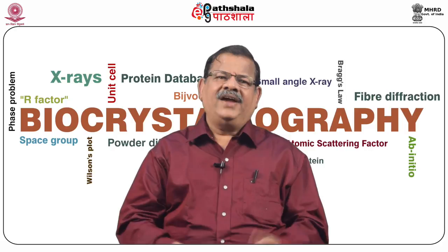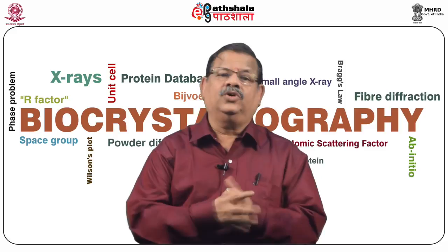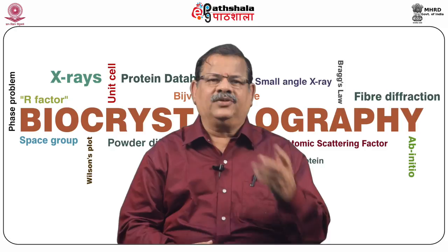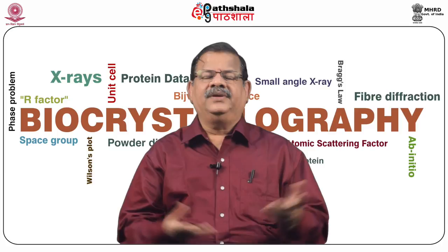Now, finally, we have to determine the hydrogen atoms. So far, we determined only the non-hydrogen atoms. Now, hydrogens are also there, maybe 20 or 25 hydrogens. They also substantially contribute to the intensities. To do that, you can do a Fourier, called the difference Fourier method, by feeding in all the known part and getting the unknown part, hydrogen. But usually, the referees request you to geometrically fix it, no? So in the same program we have a provision called the HFIX command, using which you can geometrically fix the hydrogen. And the final R factor, as I told you in the beginning, can be up to 5% or lesser.